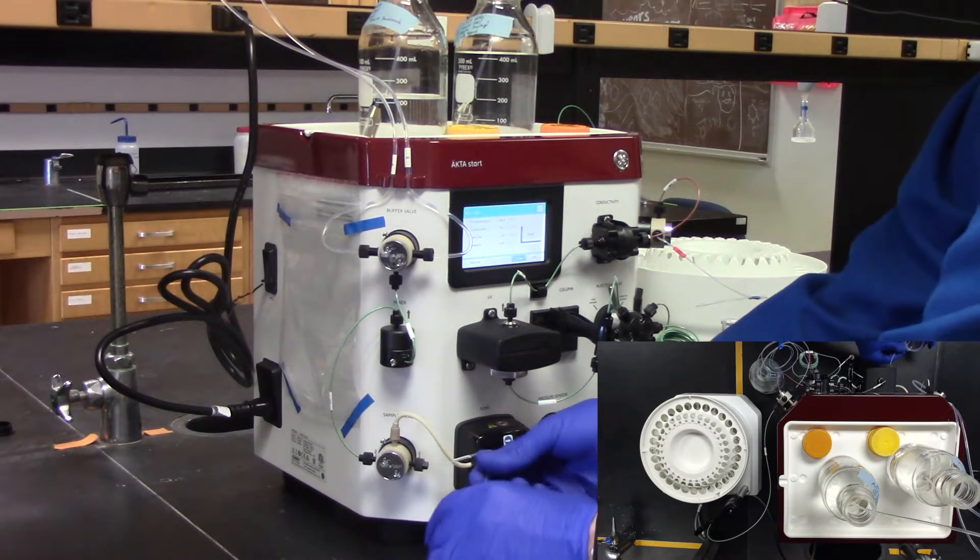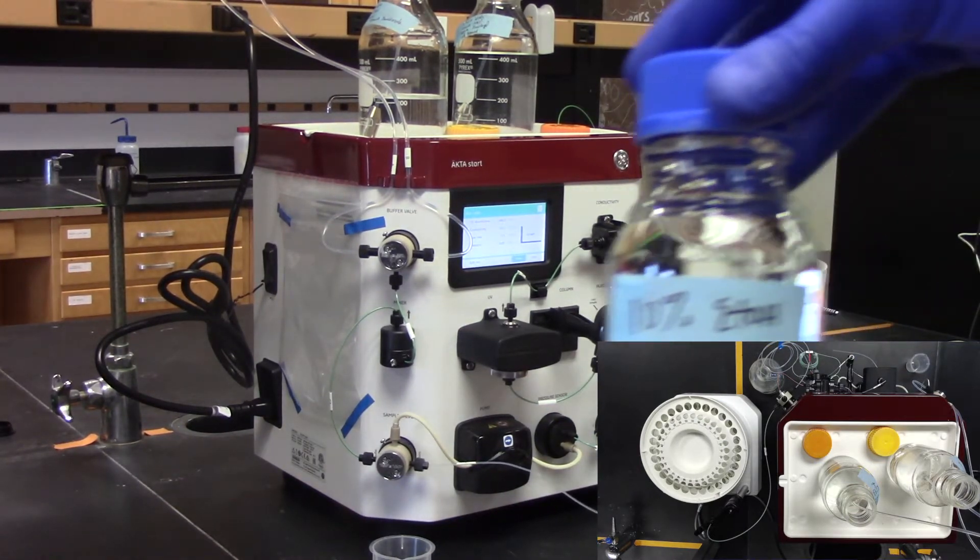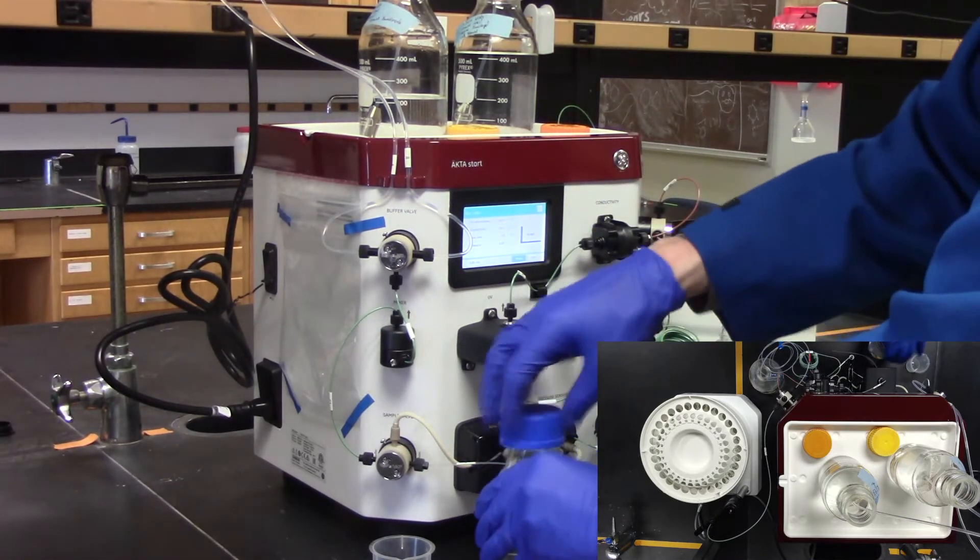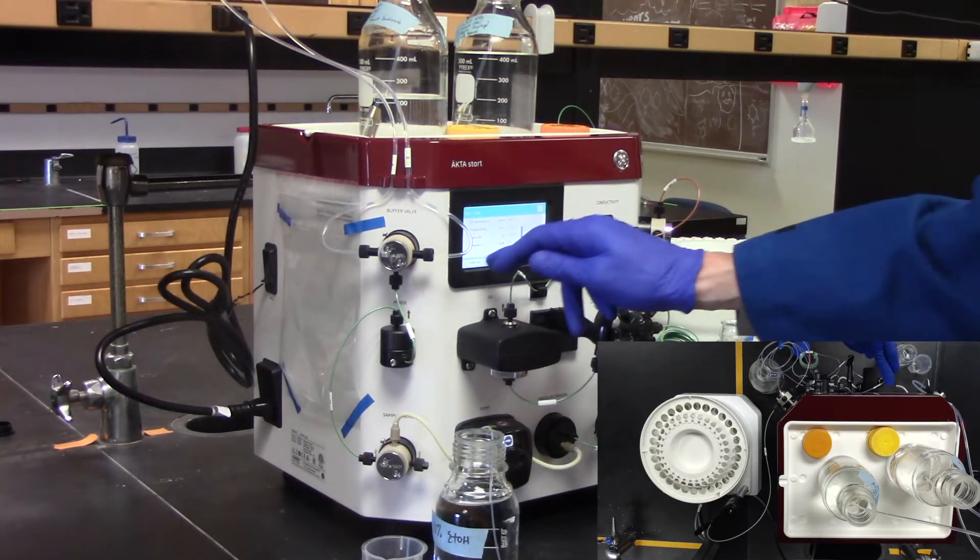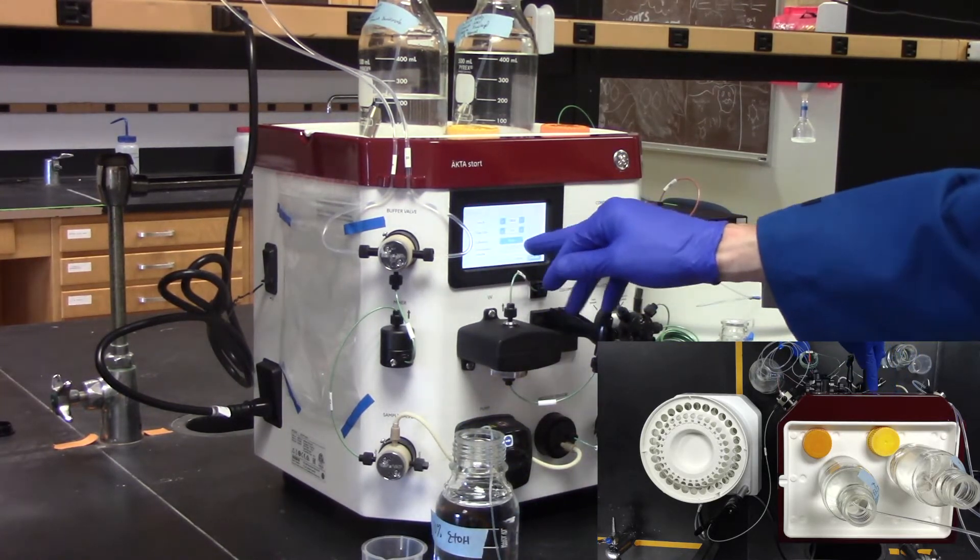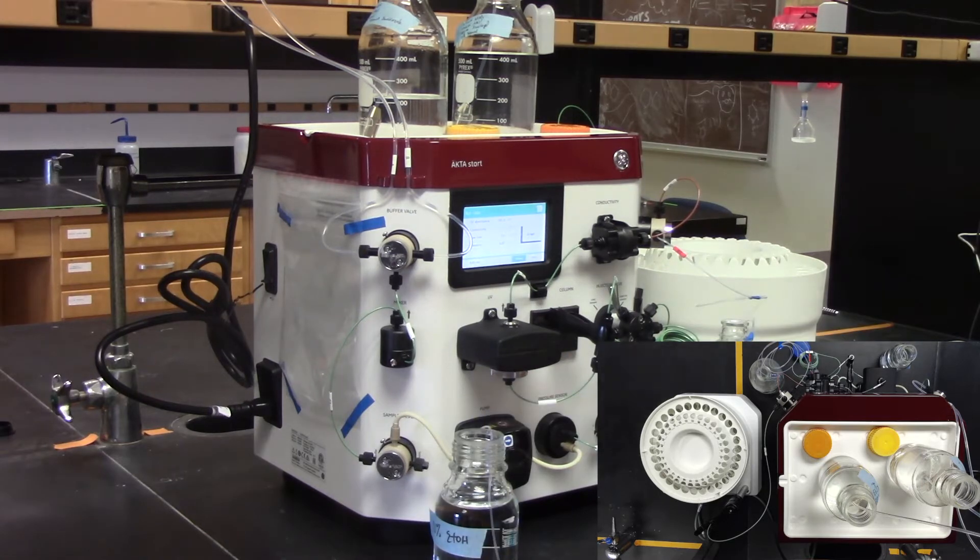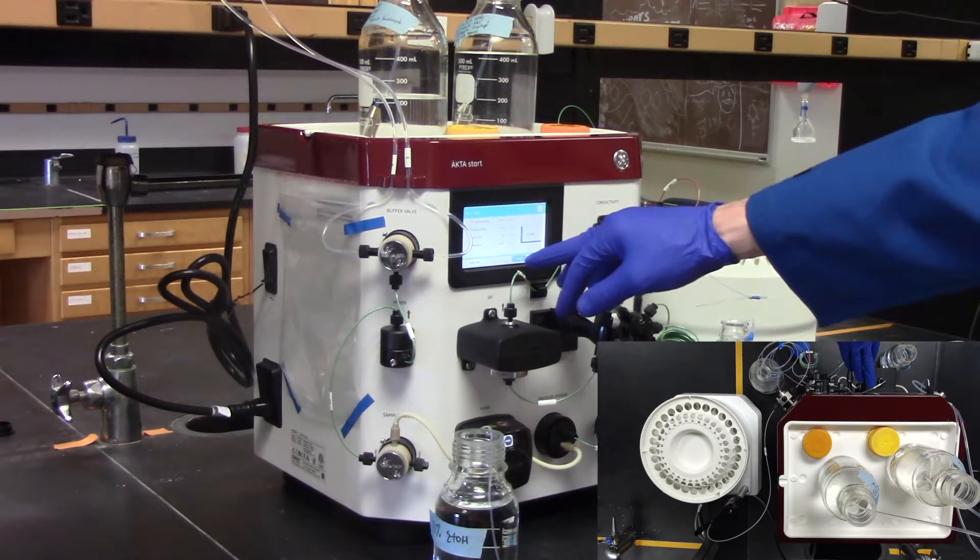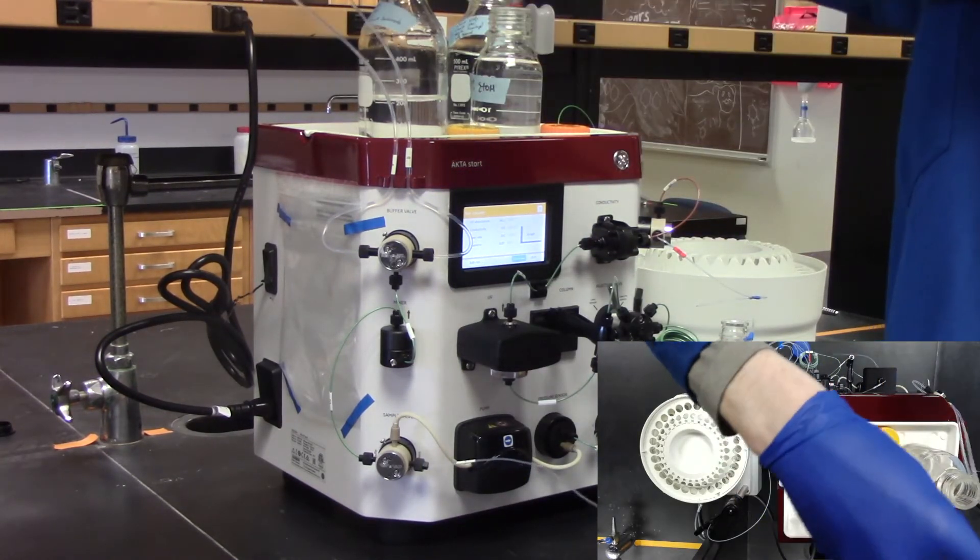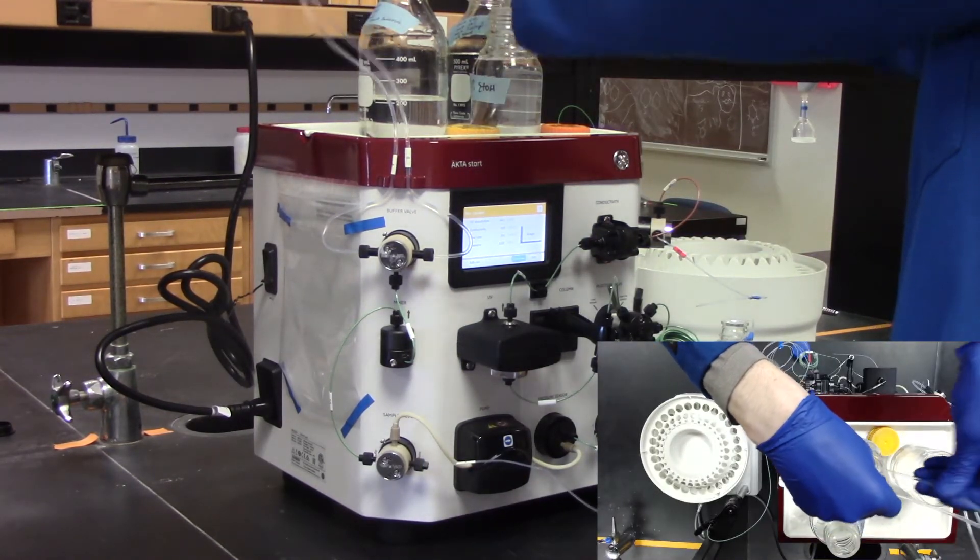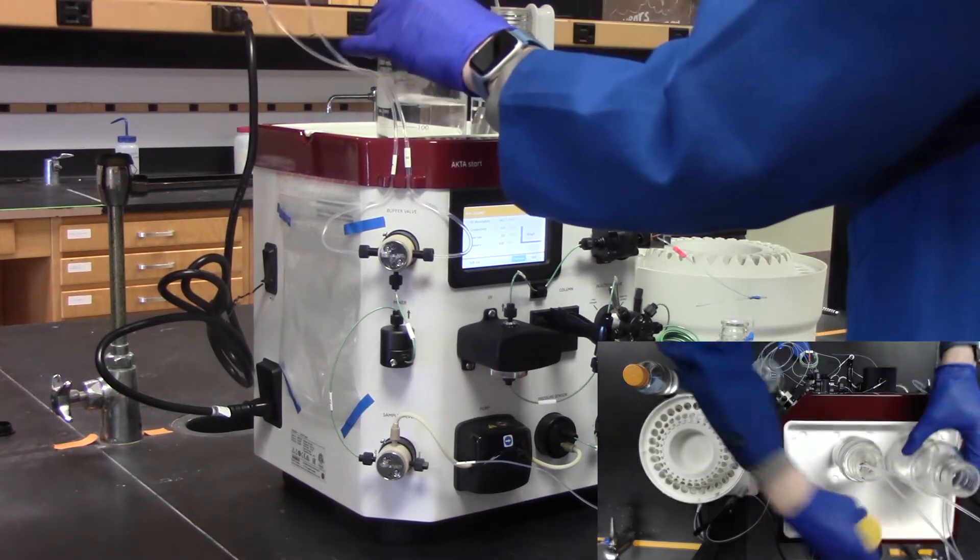It's now time to clean the FPLC. To do so, place the sample line in 10% ethanol and purge the sample line. Next, place the ethanol on top of the FPLC. Place both A and B lines into the ethanol and purge the lines.